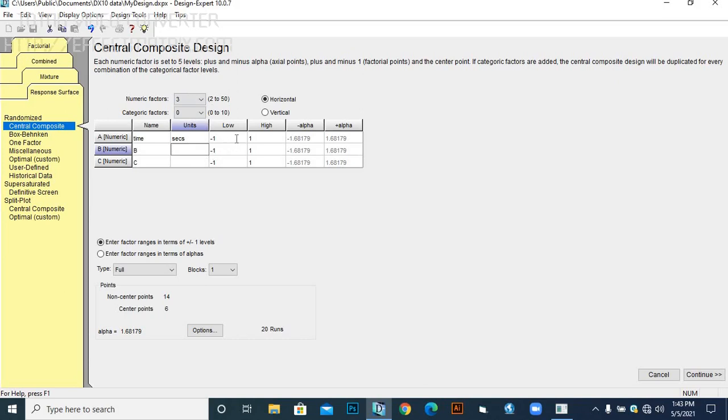Here I have a high value, so I know the high value I'm looking at. For time in seconds, the highest value may be 100 seconds. The same with this, maybe 30, maybe 120. Here you have 40, maybe here you have 160. Oh my, this viewing center will not allow me to do this. So let's move on now. Here we go, we have 40, 160, and then we get to this point.